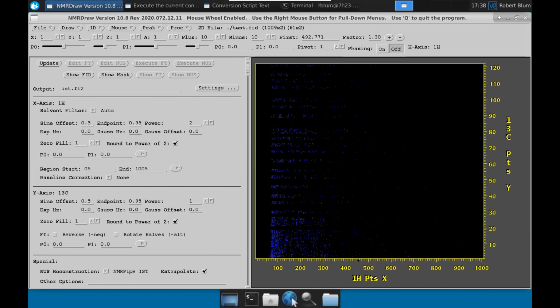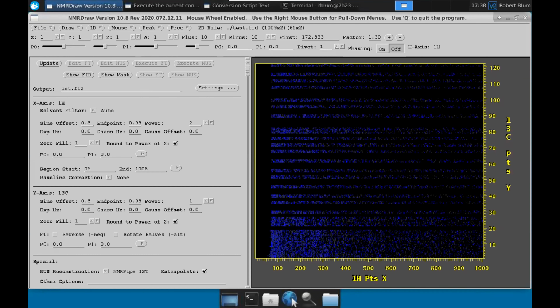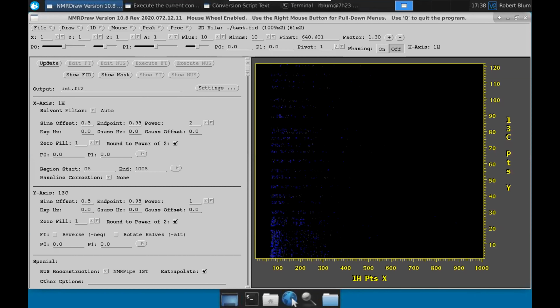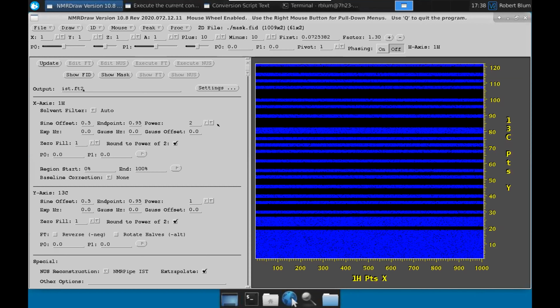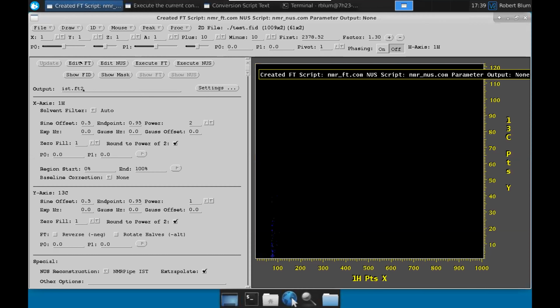So it's a historical artifact back in the days before four-phase shifters, 0, 90, 180, 270 were available. And Al Redfield was the guy, I think it may have been Al Redfield who first figured out. It was Al, absolutely. That if you had a 0 and 90 degrees phase shifter and you alternated the sign of alternate points, that you could mimic a four-phase box out of a two-phase using a two-phase shifter. Yep, I guess it's actually written in the source code, the Redfield trick, in the source code of both Bruker and Nicolet. It was actually Dave Dalrymple that wrote the Nicolet software and had it in there.